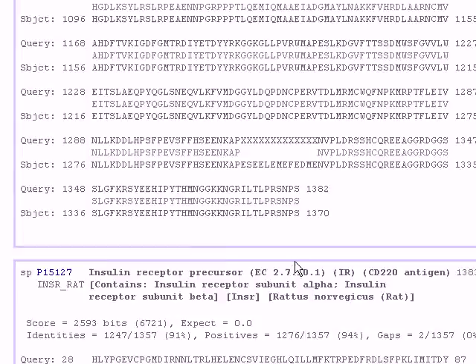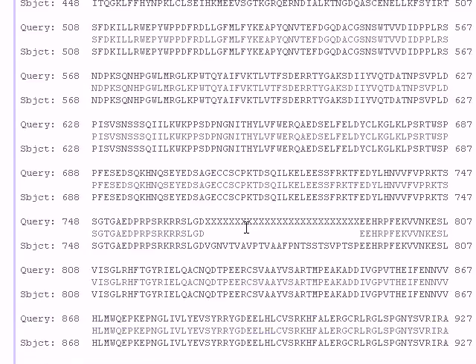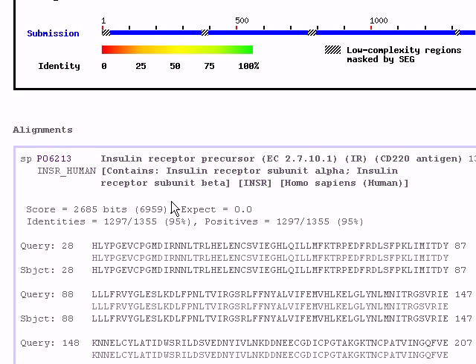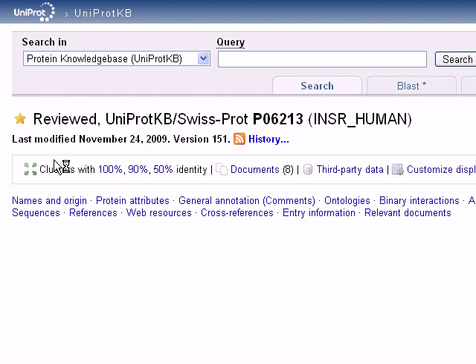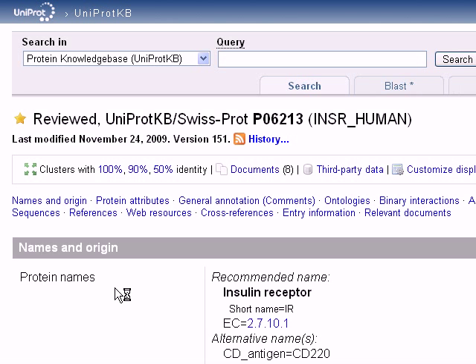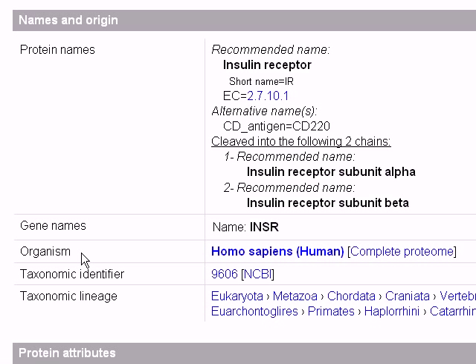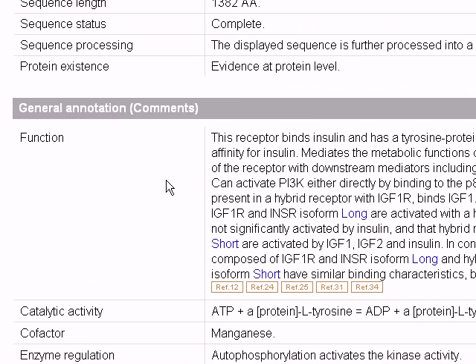For example, if you want to see information about the first sequence, which is an insulin receptor precursor, we can click on the accession number here. This will take us directly to the information file about this protein.